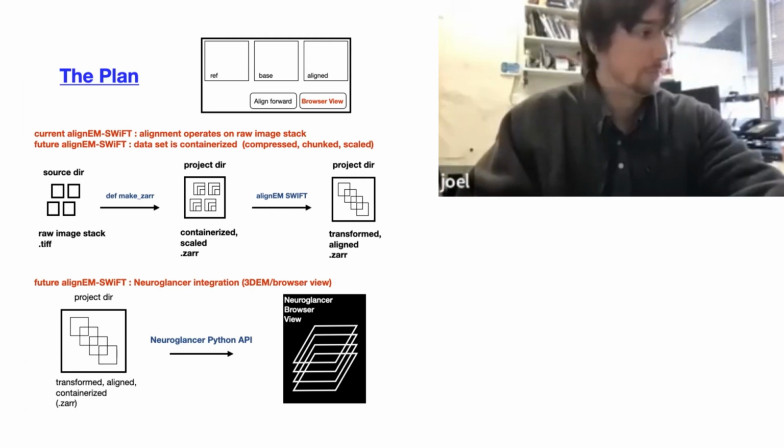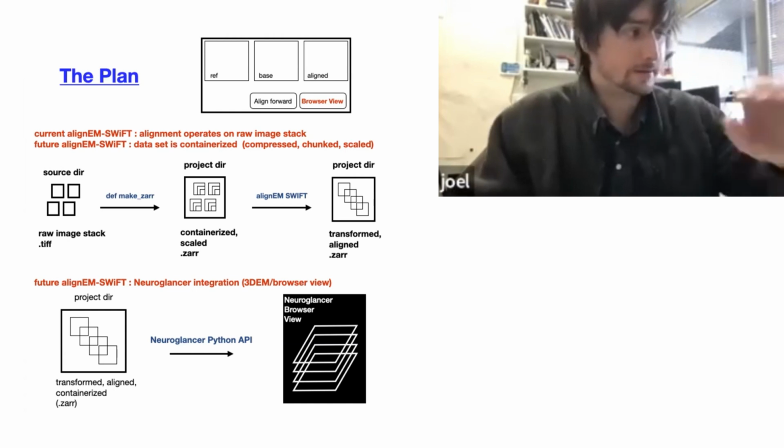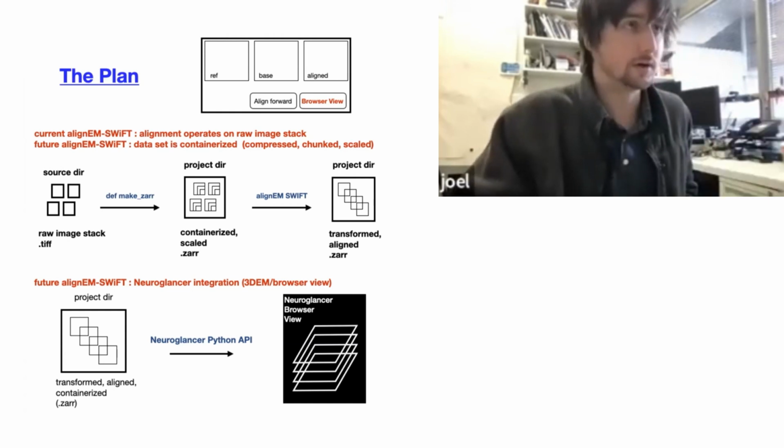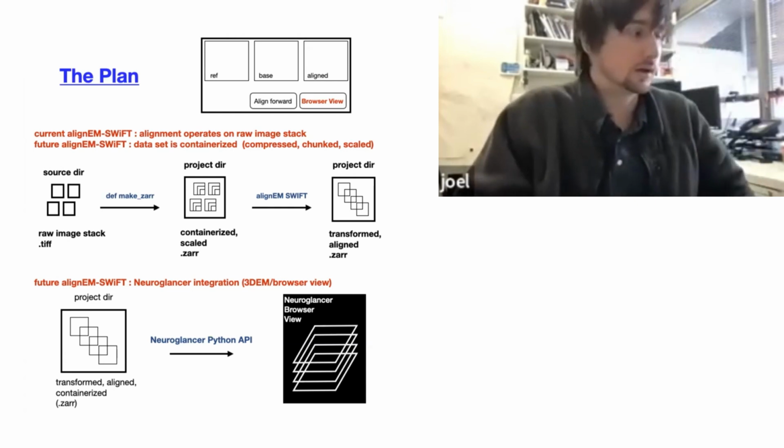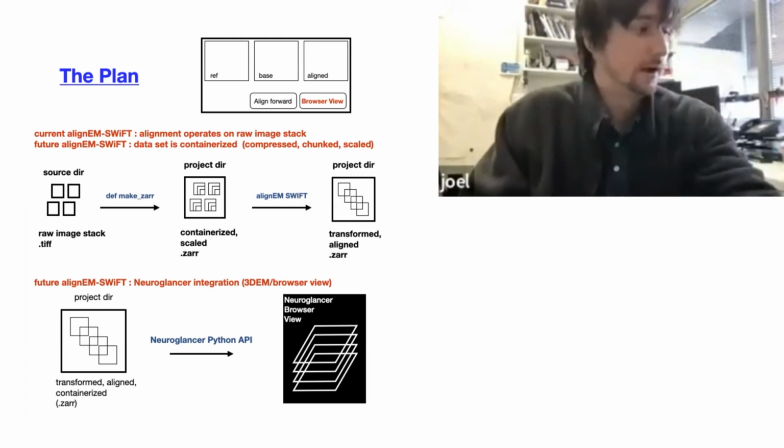So yeah, it's a powerful opportunity. I agree. It hasn't been at the top of my mind what all we can do with the metadata, but I'm glad you see it as a useful opportunity, because anything that's in the metadata or the attributes file is good. So let me show you an example right here.